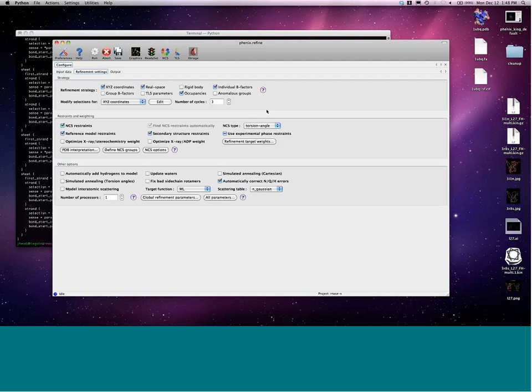Okay. And you guys have the software support through SBGrid. We typically update Phenix on a regular basis, so you always have access to the newest releases. And also for DEN, we remember we had the webinar, I think, a couple months ago, Daniel Donovan. We also, if you wanted to check more weights and run it on the grid, have facilities for this, so you can just email us to ask for access. Great. That's good to know.